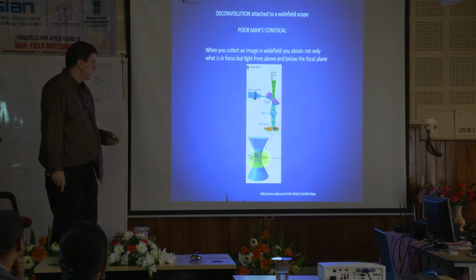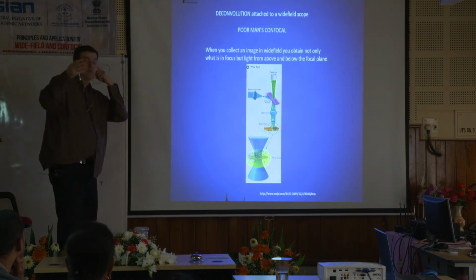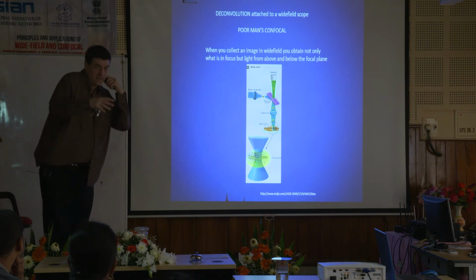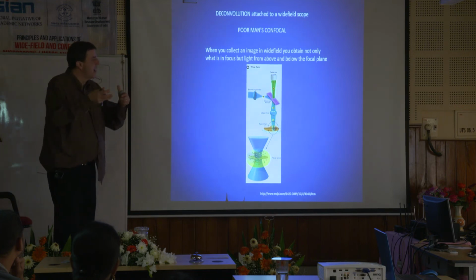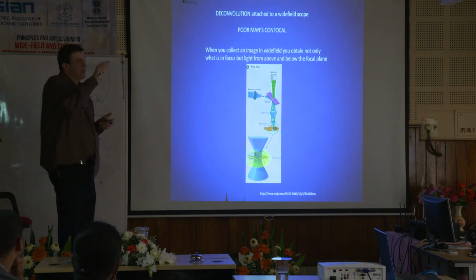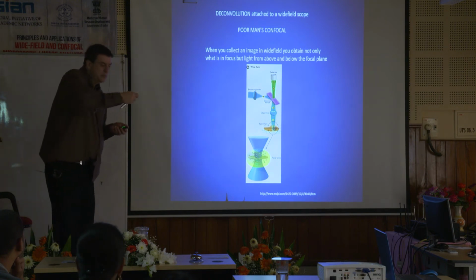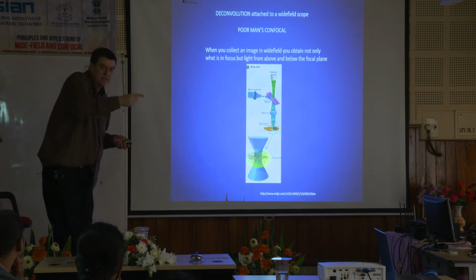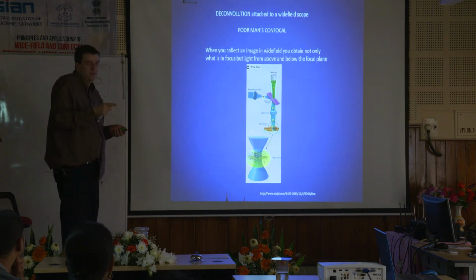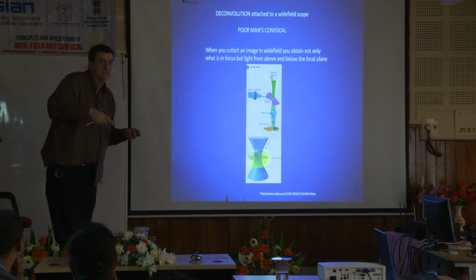Okay. Now, if you go to buy this for the institution, the one thing you have to keep in mind is that the MetaMorph I'm giving you has everything. Okay, it has absolutely everything they make. But when you buy a setup of MetaMorph, it's like a la carte. Do you know what a la carte means? A la carte means like if you go to the restaurant, you buy the potato, you buy the bread, you buy each item separately. So the way they sell MetaMorph is they give you a little bit of a package, but then they sell you each item separately on top of it, depending on what you need.